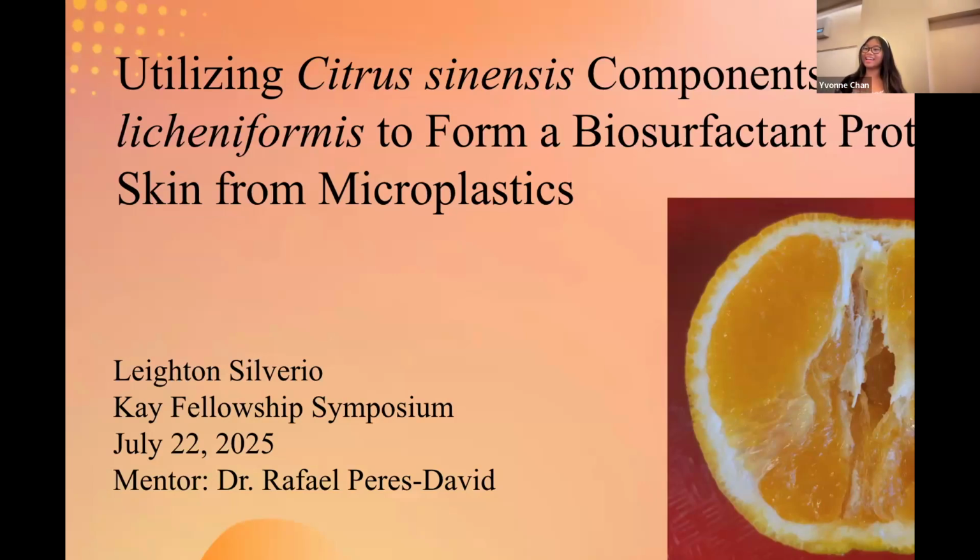I'm Leighton, and today I'll be showing you how I use orange components with the bacteria Bacillus licheniformis to form a biosurfactant that protects skin from microplastics.